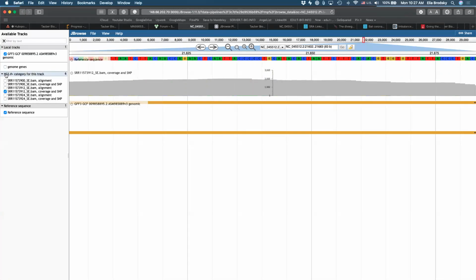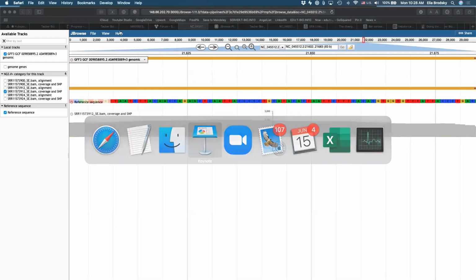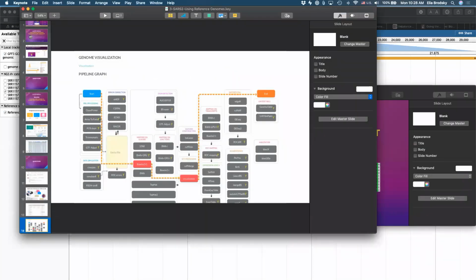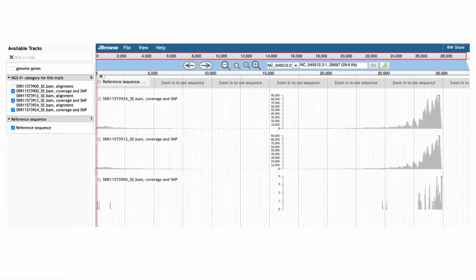Okay, so one thing that I wanted everybody to be able to see is that you can have a number of different outputs. So actually, not to go through that interactively because it's going to be challenging for all of us to see that at the same time. This is the output that you should have gotten. Again, I only selected here the coverage and not the actual alignment of reads. But let's take a look at what we see here.